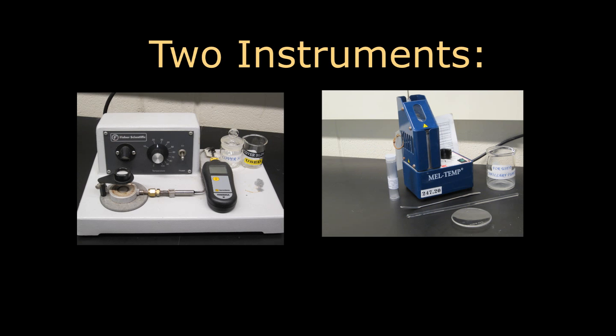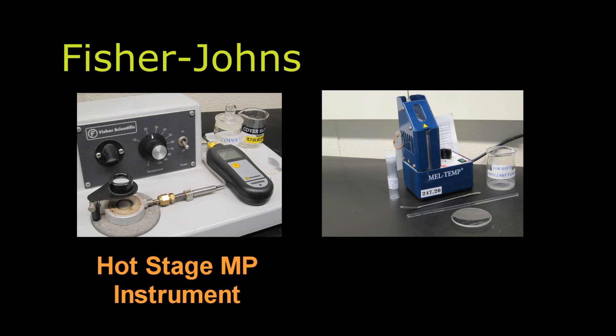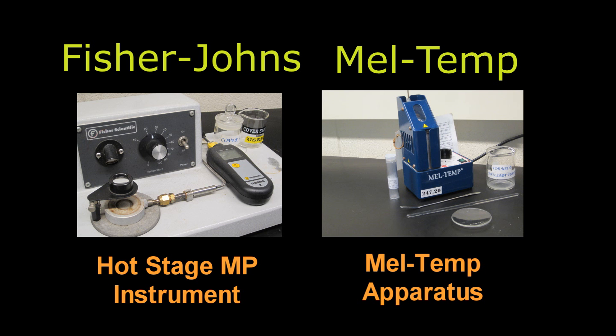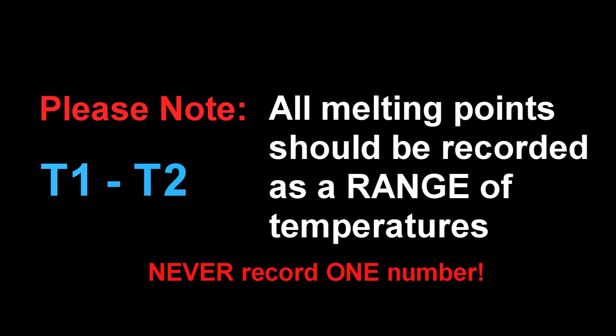There are two main instruments used to determine melting point: the Fisher-Johns apparatus, or hot stage melting point instrument, covered in the first half of the video, and the Meltem apparatus covered in the second half. All melting points should be recorded as a range of temperatures. The first value is the temperature at which a crystal or solid begins to melt or gloss over, while the second value is when the crystal or solid is completely liquid. Never record one number.